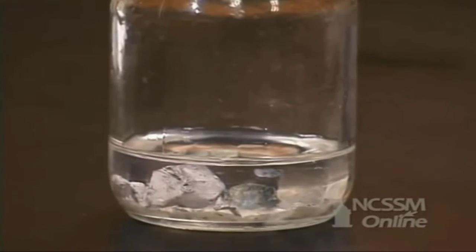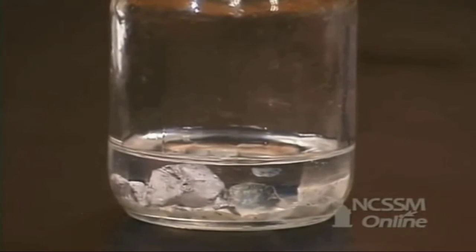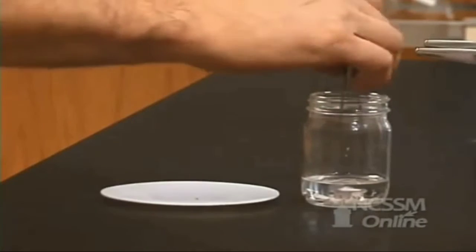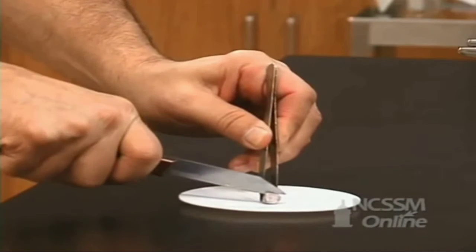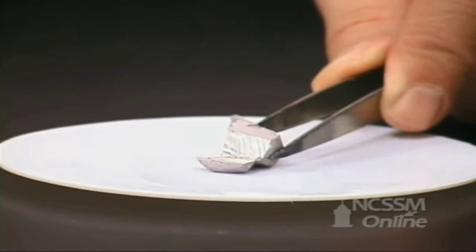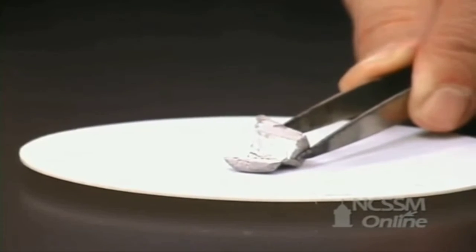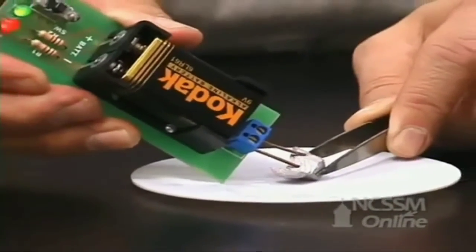We'll go down the column on the periodic table in group 1 and look at sodium. Like the lithium, the sodium is stored in a mineral oil to minimize reaction with the oxygen in the air. If we remove a piece of sodium metal, we notice that it's also coated over with an oxide coating. Group 1 metals become softer as you go down the column. The sodium is much easier to cut than the lithium. As we cut off the oxide layer, we can see the shiny metal underneath. It coats over very rapidly with a layer of oxide. The sodium is a metal and is an excellent conductor of electricity.